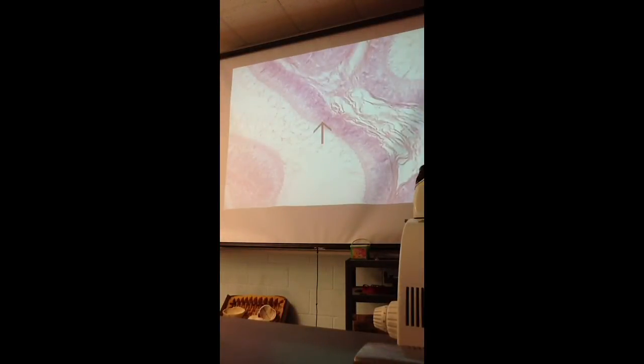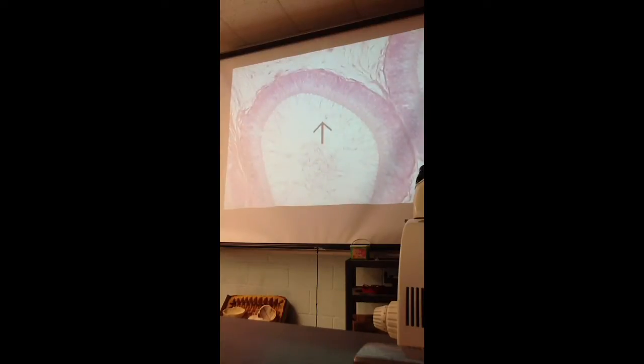But the best way to identify the epididymis is when you look at these structures in the lumen. You see all these fine hairy structures, they are actually called stereocilia. Actually the word stereocilia is a misnomer because they are not cilia. They are more like branched microvilli. They are close to villi, but still they are called stereocilia. It's something like the cell membrane throws up into folds. That's called stereocilia.